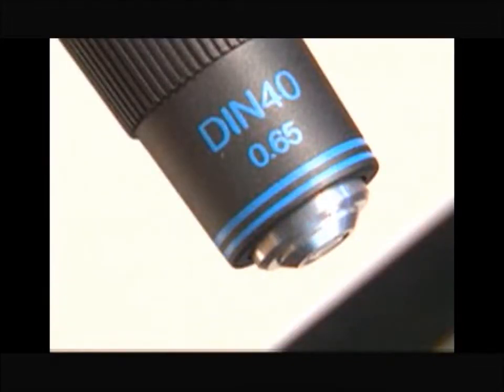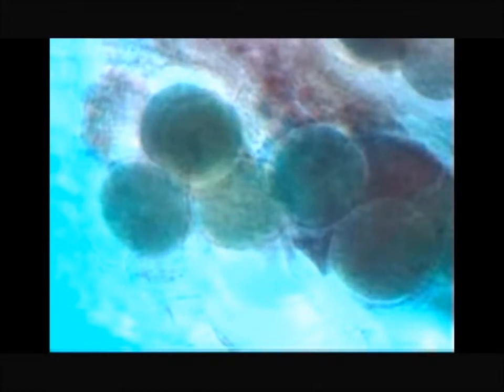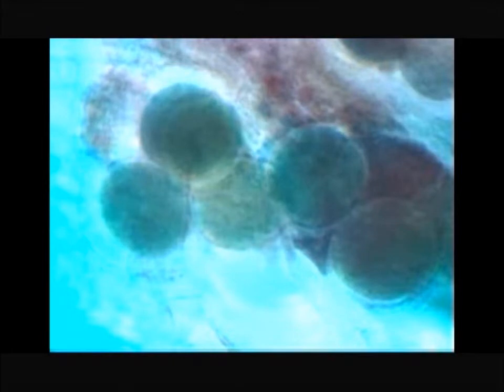When you combine a 10-power eyepiece with a 40-power objective, the overall magnification becomes 400. These are the brine shrimp's eggs magnified 400 times. Each magnification teaches us something new and different about a specimen.